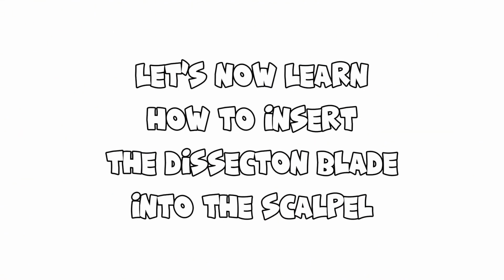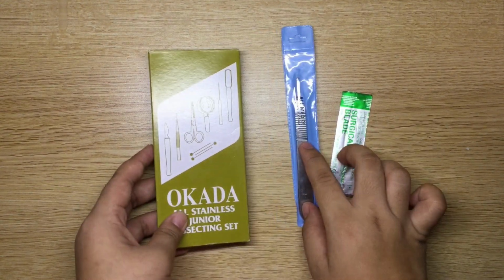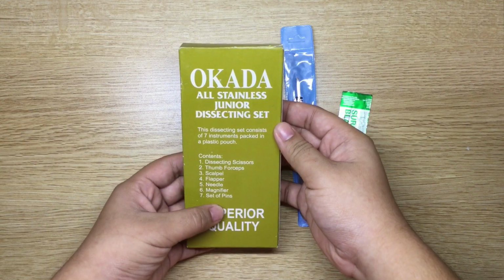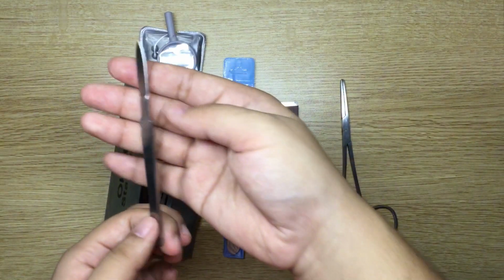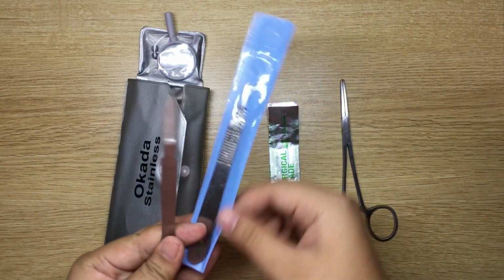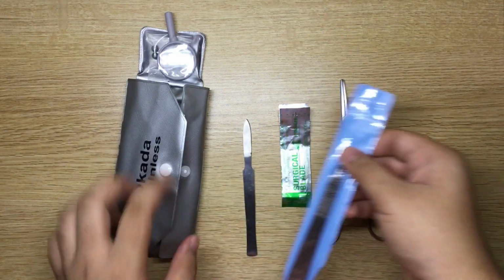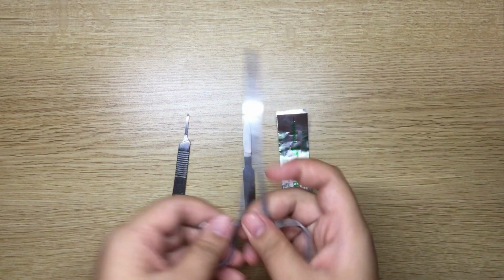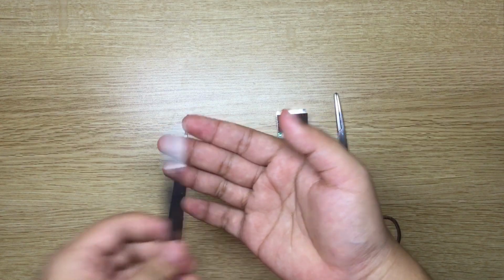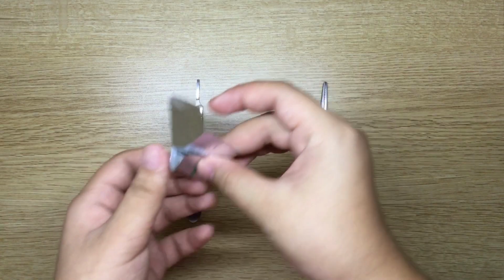Let's now learn how to insert the dissection blade into the scalpel. Here, we have the dissection kit for juniors, as my group members mentioned earlier the contents. But we're not going to use the scalpel that the dissection kit already provided. As you can see, it is not detachable and we can't insert blades in here. Unlike the scalpel handle, we can insert blades. We also have the hemostatic forceps that we are going to use to insert the blade. We have an example here, a number 11 blade and a blade holder number 3.